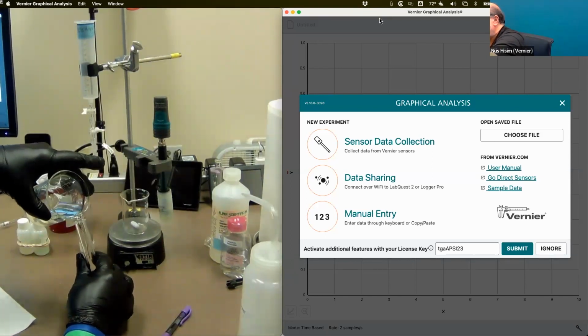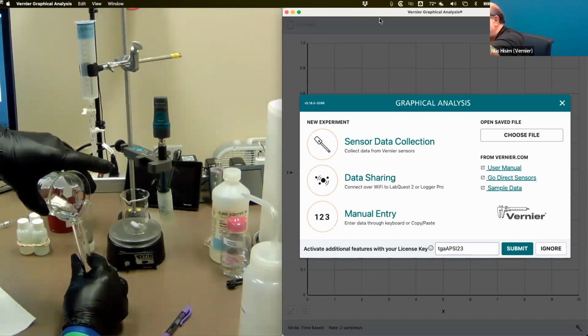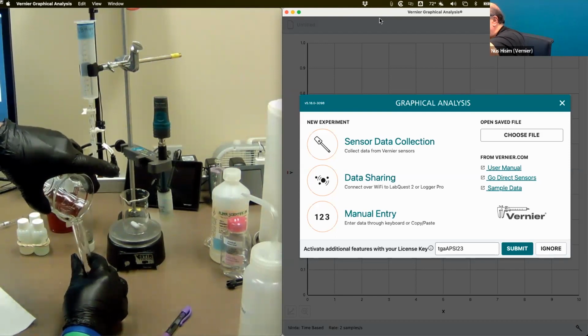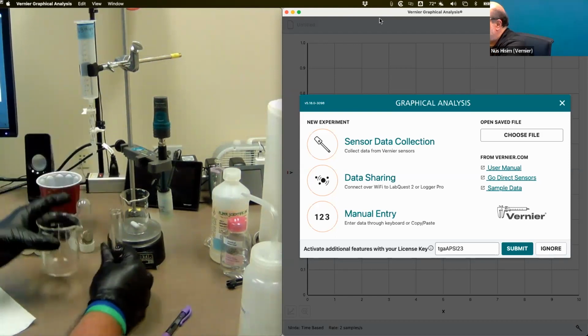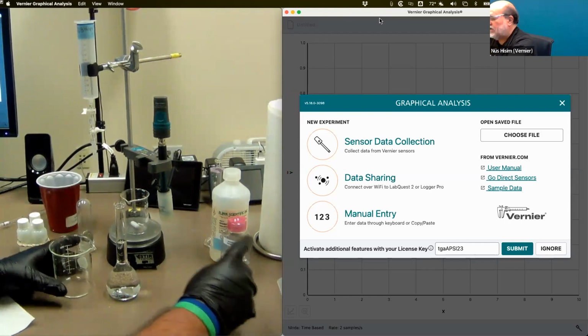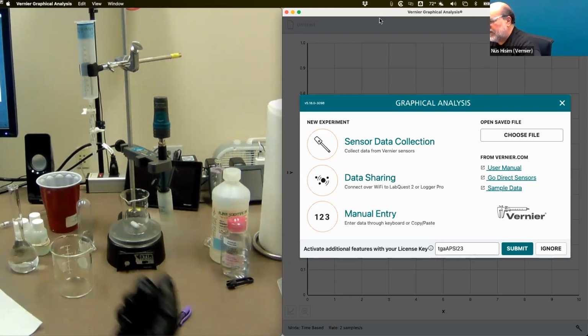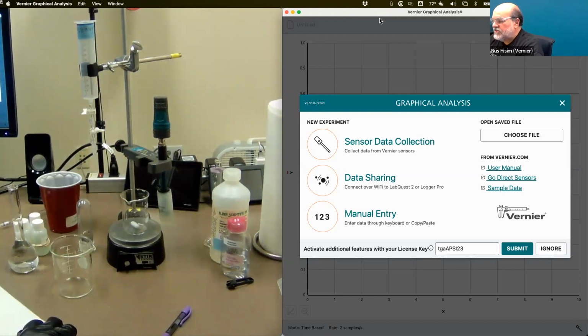And of course, this adds a little level of complexity to the analysis later on. If you look at the experiment, it talks about the volume of the original contaminated makeup remover, so they have to keep track of all that stuff when they're actually doing the experiment.